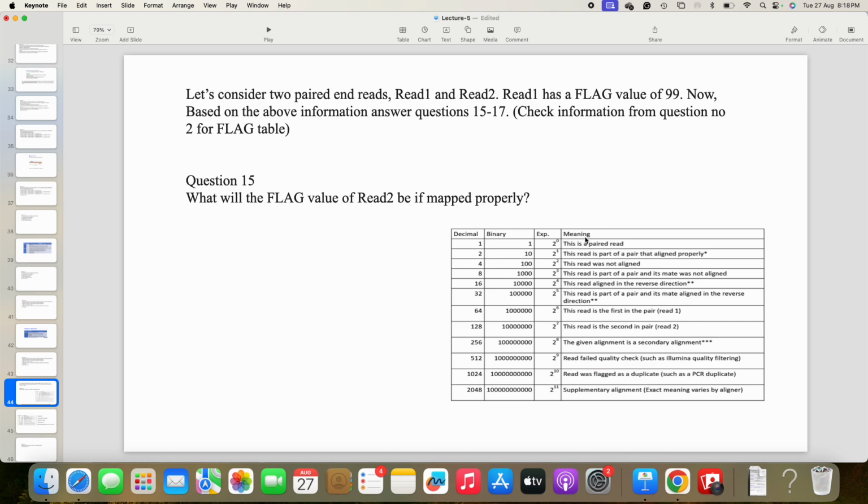So basically, these are all the fields you can use to analyze your alignment data. Certain fields are given, so you can properly go through them and analyze whether your alignment has aligned correctly, where it has been aligned, or what the score of the alignment is. So you can rely on your data more accurately, and on whether the alignment is proper or not. You can get all these from the field values present in the SAM file.